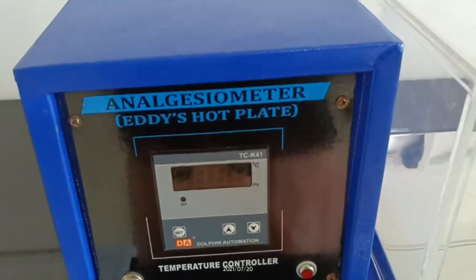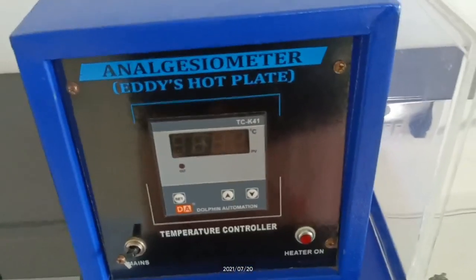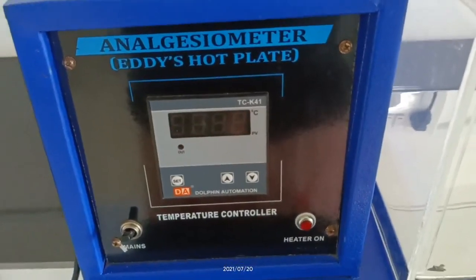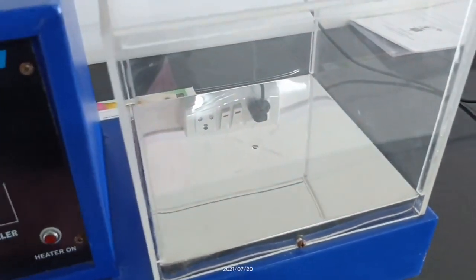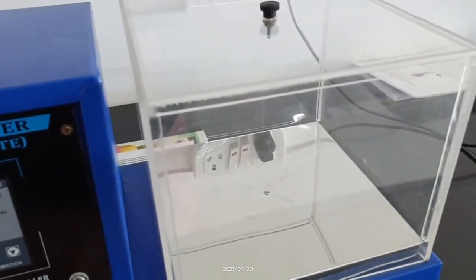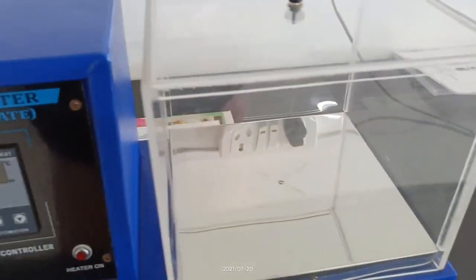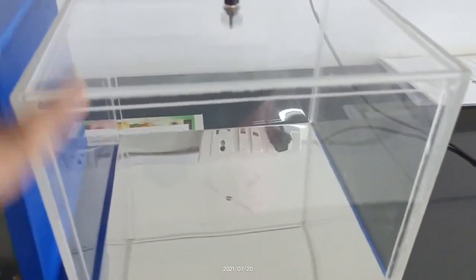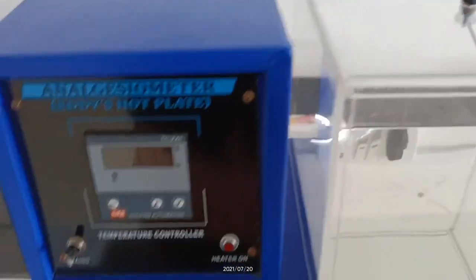The temperature should not be too low or too high; it is maintained at around 55 degrees Celsius. When the animal experiences this thermal pain, responses like paw licking start. We record the time at which the rat placed on the hot plate begins paw licking or jumping, and we use that recorded response time to check the analgesic activity of the drug.